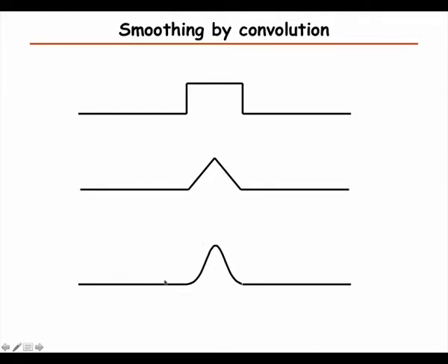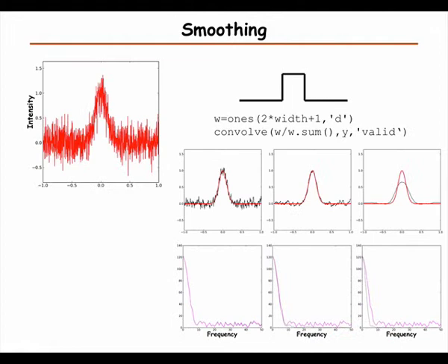As you can imagine, when we move these shapes over our function and always calculate the overlap, we're going to get slightly wider features and a more smoothed function. For example, here we have the same as we looked at before, but instead of cutting in Fourier space, we move this over, which just means that we weight things differently.